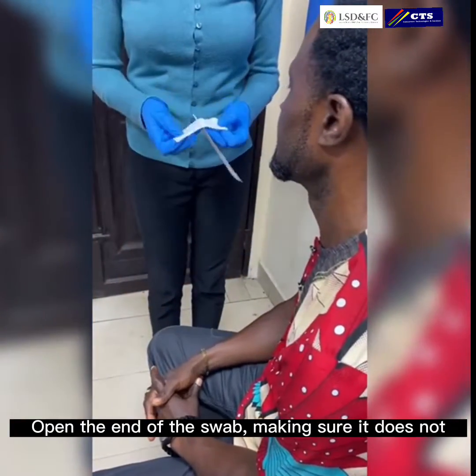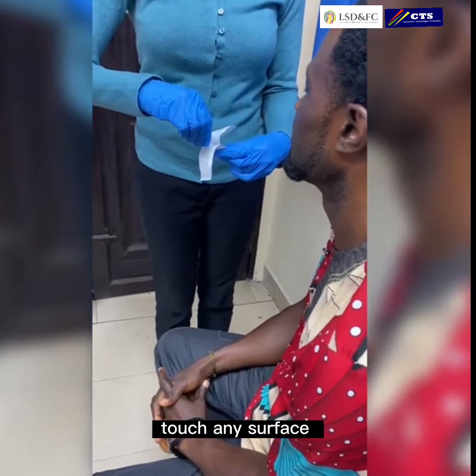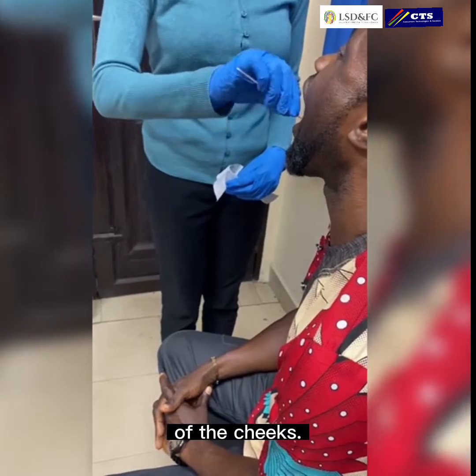Open the end of the swab making sure it doesn't touch any surface, and with gentle pressure rub it against the inside of the cheeks.